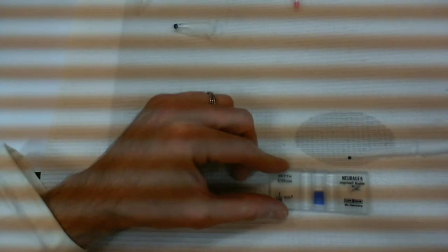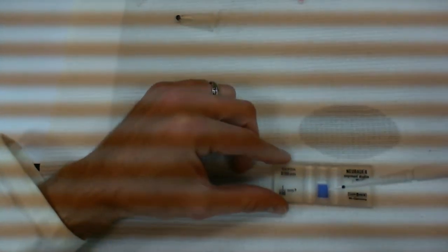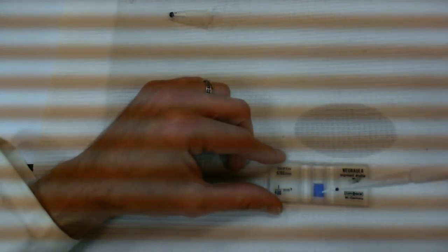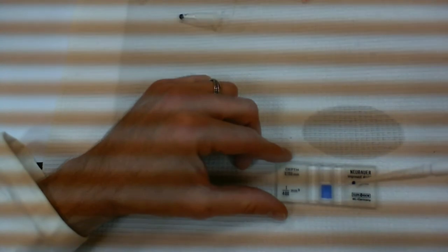I took out 10 microliters. I have less than 10 microliters in the counting chamber again. I can't tell you what volume to put in here because depending on where your cover slip ends up on this, you may have a larger or smaller volume in here. So 10 microliters to start off with, and then just start pipetting carefully until you fill the whole thing. Okay, and then you stop.